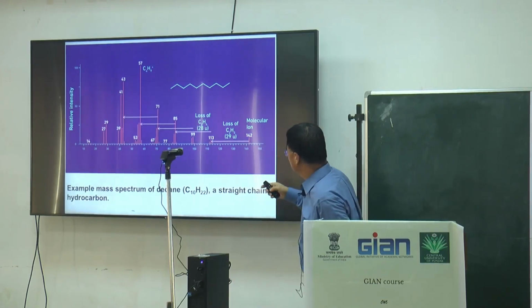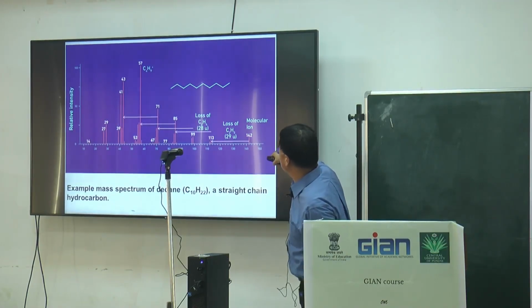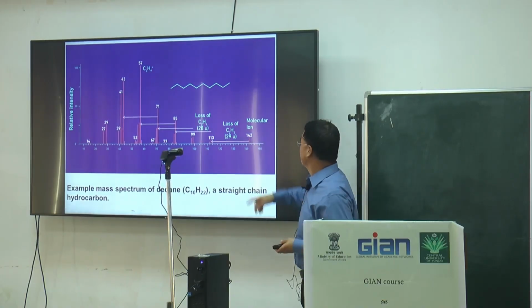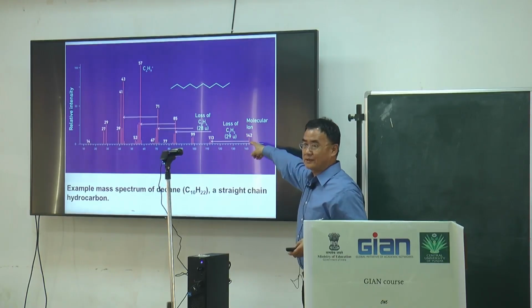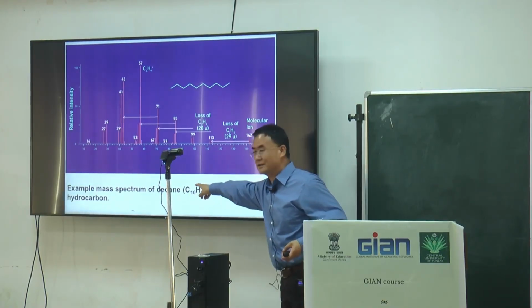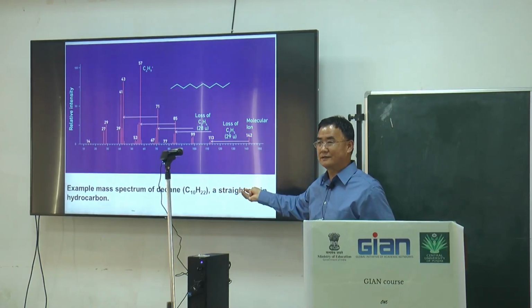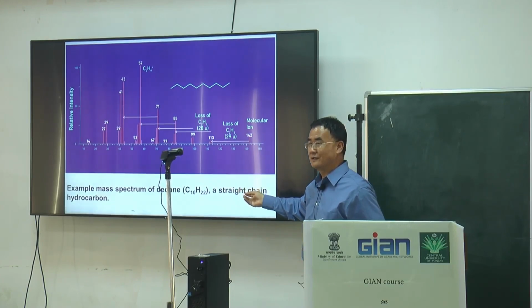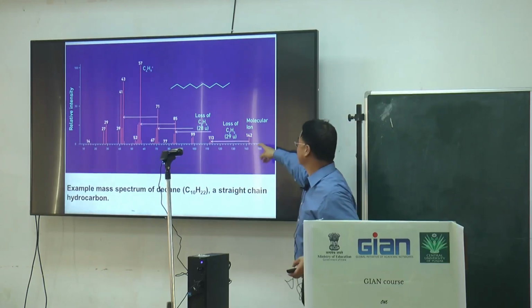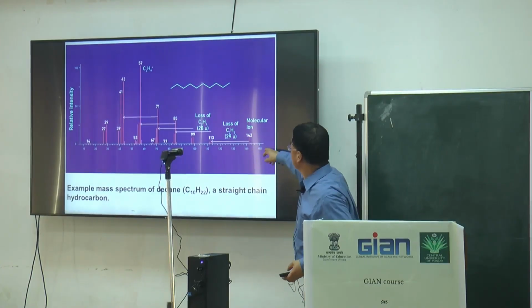So from this mass spectrum, we show this is the molecular ion, right? The molecular ion peak is 142. Relatively close to it, they have 10 carbons, and how much? The 120, right? 120 plus 22, the protons, yeah, it's 142. That's how they show up the m/z ratio.